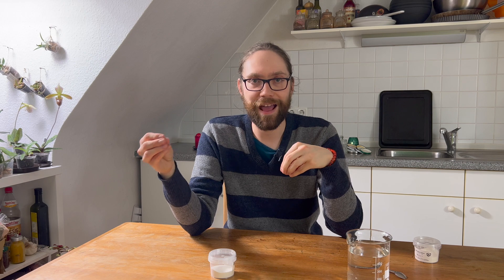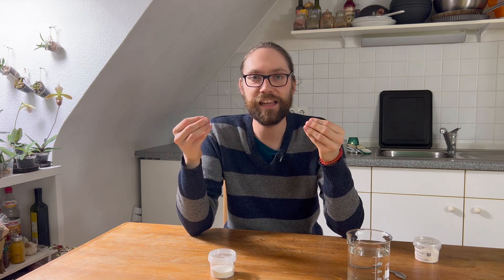So if you think about growing plants and seeding a seed, you usually just put them into soil and let them do their thing. This doesn't really work with orchids though, because orchid seeds lack an endosperm. An endosperm is a fancy botany term for basically a reservoir of nutrients that the little baby plant can use as it grows to produce new tissue.